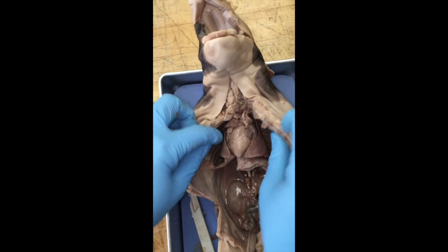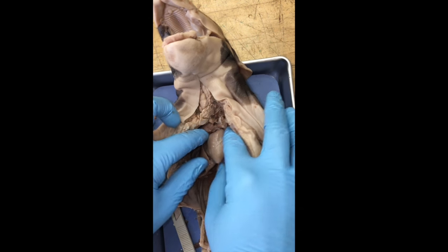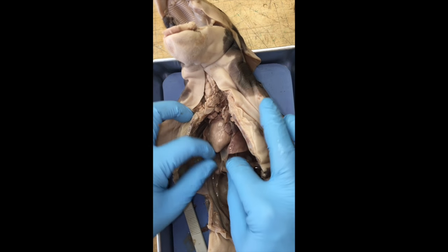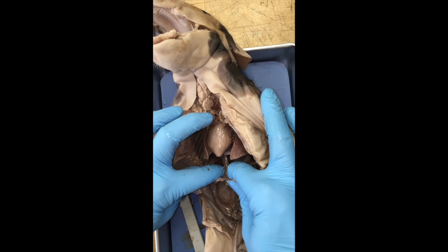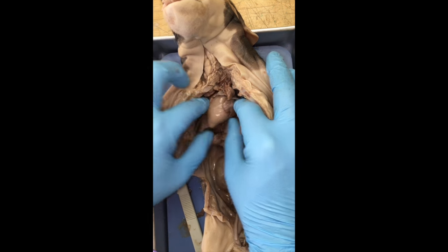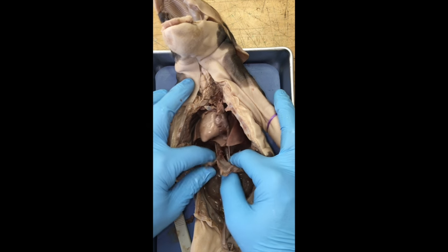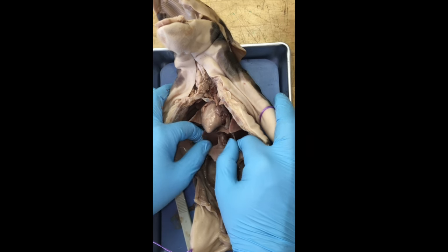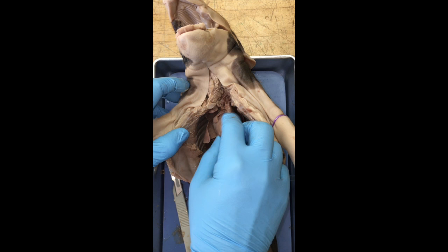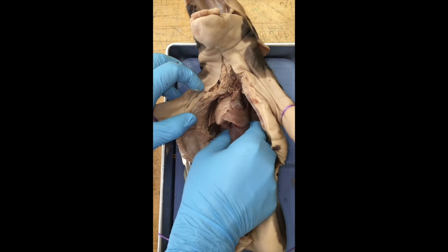Moving to the top side of the diaphragm, we will see our heart — the big structure right in the middle — and the lungs surrounding it. Pull the diaphragm down a little bit out of the way. You can see these little lobes of lung surrounding the heart. The lungs are what you use for your respiratory system for breathing, and the heart is for the cardiovascular system — pumping your blood. Next we're going to take the heart and lungs out to inspect them further.